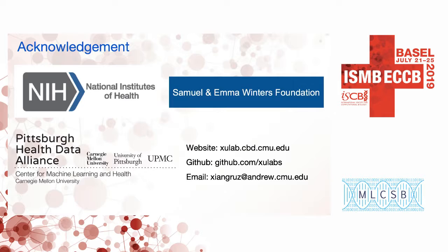I understand. Of course, in the experiment you showed, you must have the labels on the target domain also, because you evaluated the accuracy, right? So in this setting you could study this, but I see the point, you may need a large number of labeled samples too. Yes, it took us a lot of time to annotate the training data set because it's not automated. After the template matching process, we also need to do some manual quality control to visually look at them and see whether it's that structure or not. And it can be biased because different biologists may have different opinions.